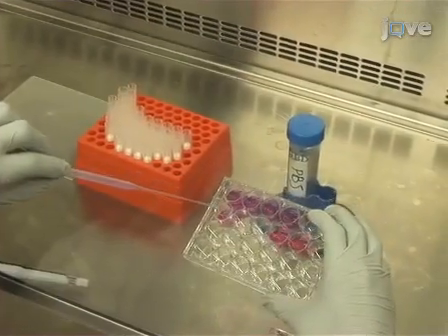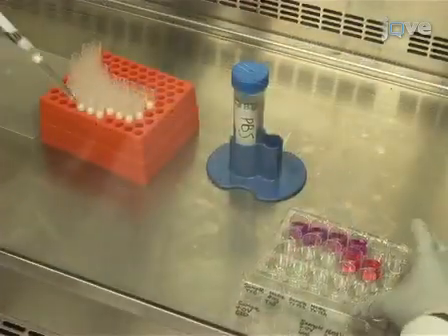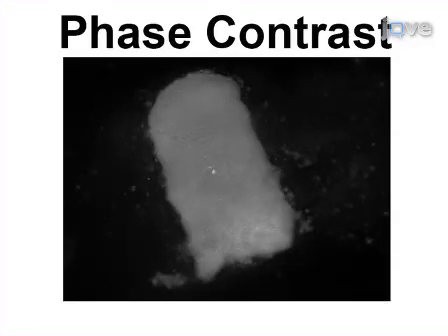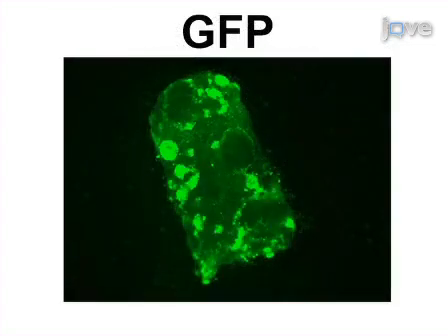First, aspirate the media from the GFP-expressing vaccinia virus treated well and wash twice with PBS directly in the well. Then, using a fluorescence-capable dissection microscope, take a phase contrast image of the tissue piece at an appropriate resolution of ×40. Next, switch to fluorescent mode and, using a GFP-capable filter, visualize GFP expression in the GFP transduced tissue. Finally, use a fluorescent filter for another wavelength as far as possible from that of the transgene of interest and take a picture of background fluorescence.